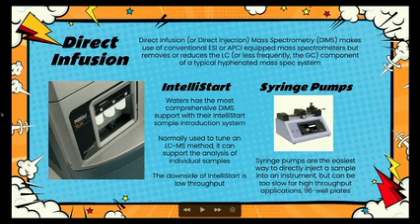The downside of that is it's quite low throughput. There's a lot of purging of the fluidic system. If you're familiar with Waters, it can be quite a slow, laborious process. One of the other options, if you've got something maybe like an Agilent system, is that syringe pumps are available. Get your sample into a syringe and then just inject it at a steady, maybe a microliter or 2 microliters per minute, depending on the concentration, depending on your instrument sensitivity, and start to observe what's coming through your system.